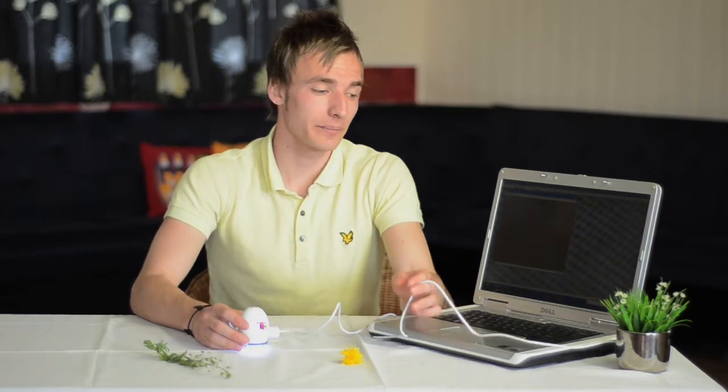Hello, my name is Richard and I'm here today to talk to you about the new RM at Home EasyScope, a very simple 43x microscope that is self-powered via USB, that allows young children from the ages of 3 to 11 to capture photos and videos of materials in greater detail.